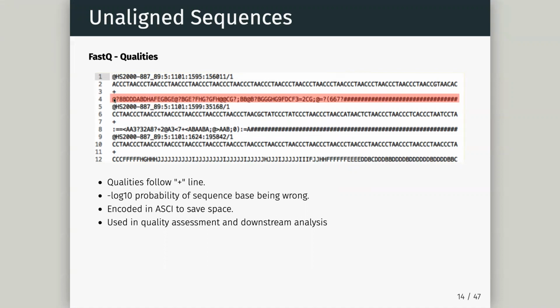We don't need that level of resolution really in our quality. We don't need to know the difference between 0.1002 and 0.1021, right? So we can bin this into a nice bit of ASCII space. And then later, whenever we pass this fastq to our aligner, although it's hard for us maybe to translate E into a probability by hand, the computer's going to have no problem. It's going to do it instantly, effectively, and then be able to say, well, a read with a very low quality, I don't trust. Maybe a read with a really great quality, I do trust.